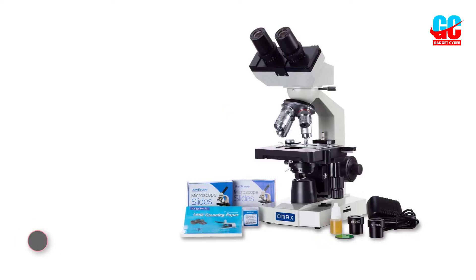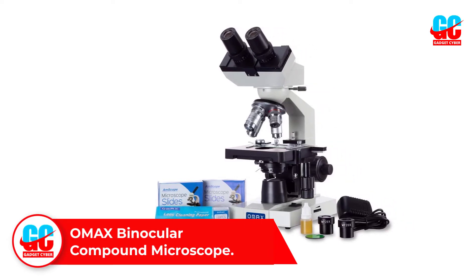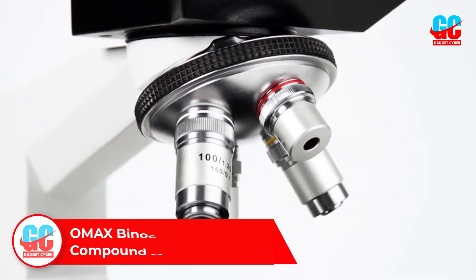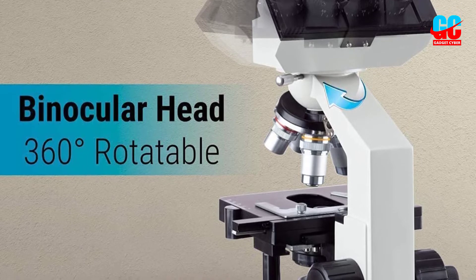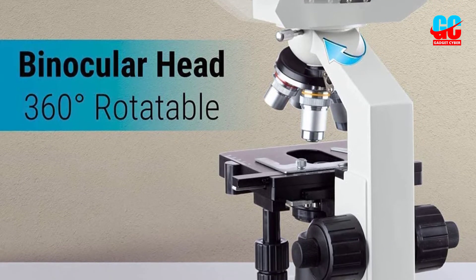Number 3: OMAX Binocular Compound Microscope. The OMAX Binocular Compound Microscope is a competent product that just missed our top 3. We like the dual eyepiece build of this device, which makes for much better viewing and easier focusing compared to single eyepiece microscopes. This one has 4 objective lenses that allow for 8 different levels of magnification.